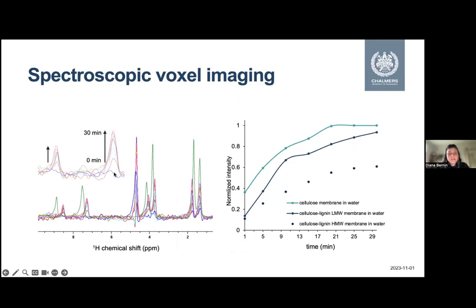And then here you can see, if you know NMR, these are the peaks from the MEMAC, and they're increasing with time. And then you can integrate this peak, and you can plot this with time, and you will get a very similar time frame. It agrees very well with what we see when the slices stabilize, so when the lines are straight.